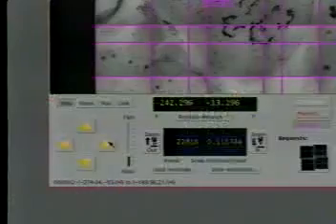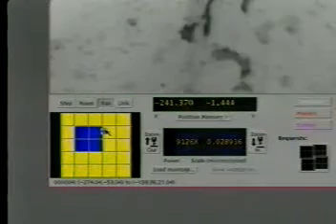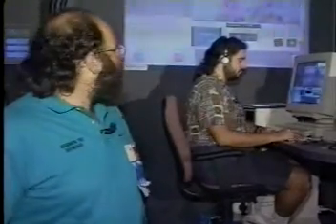Another graphical cue that's integrated into the database are called survey markers. Survey markers are little icons that show us where we have collected additional imagery at various magnifications. You can see that we can also scroll around the image using a number of different techniques. And finally, the third type of graphical marker is a tomography marker, which shows us where we have actually computed 3D reconstructions from the electron microscopic data.